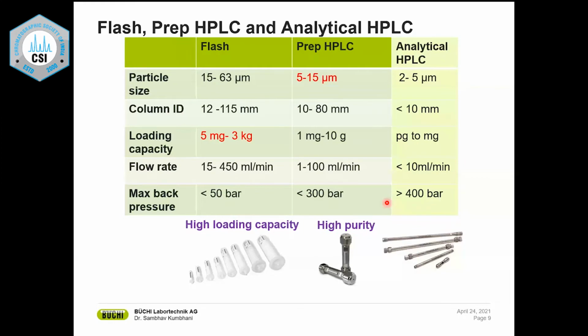As you can think from my example, the bigger the particles you use to fill up your column, the smaller the resistance and the lower the back pressure. The smaller the particle you use, the higher the back pressure, and this back pressure goes up exponentially.